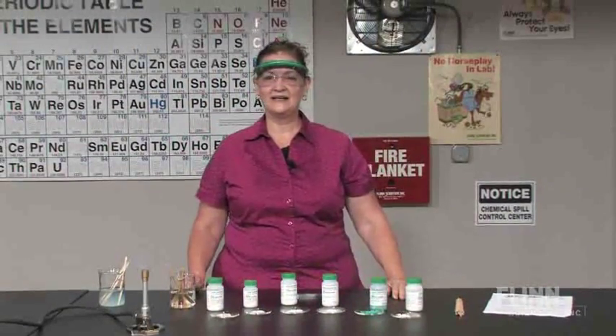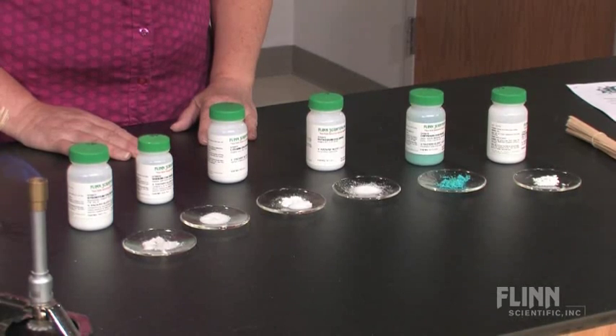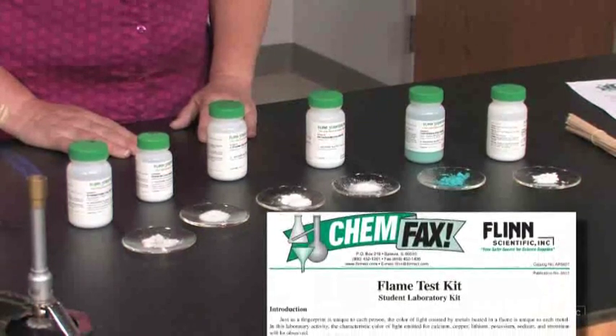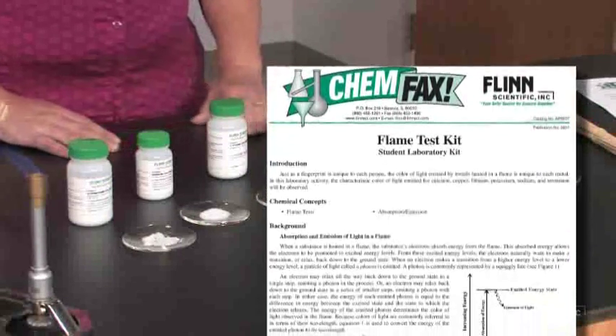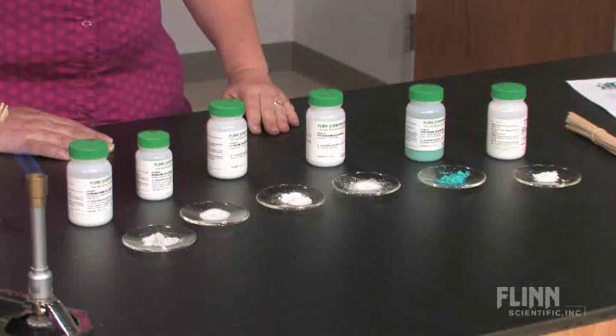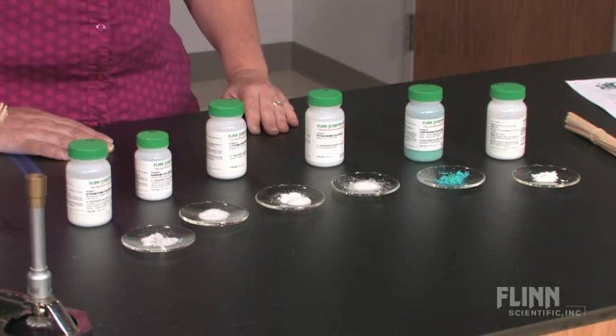Weren't those colors beautiful? This kit is ideal for physical science and introductory chemistry classes. The Chemfax has an optional extension with data analysis to challenge students in higher level courses. The kit comes complete with enough chemicals and wood splints for a class of 30 working in pairs. This is a great way to bring some hands-on science into the classroom. When I was teaching, my students loved this lab and I'm sure your students will too.